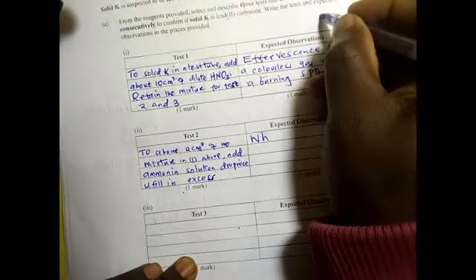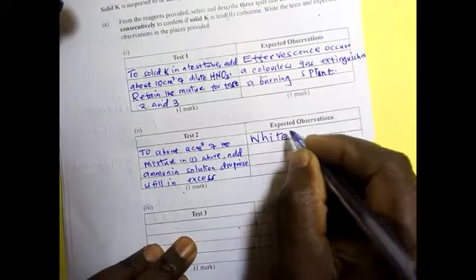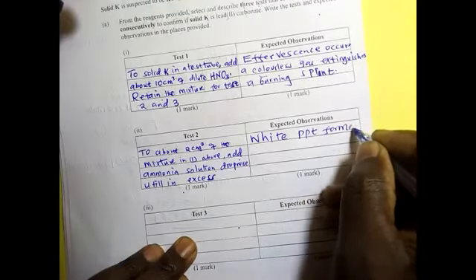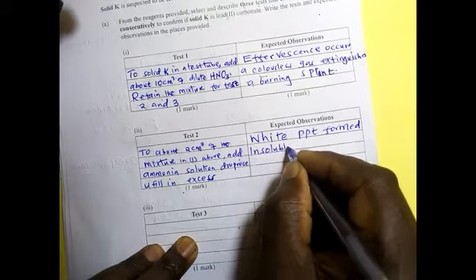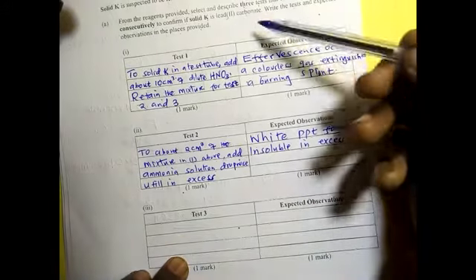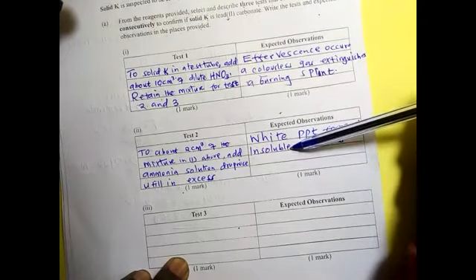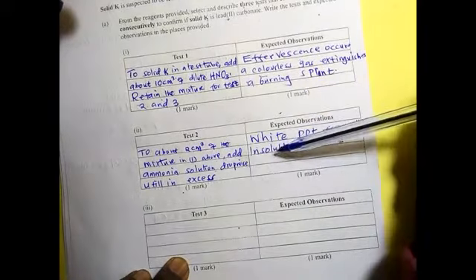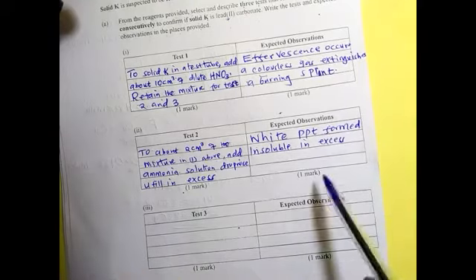Lead is among the amphoteric. A white precipitate is formed, insoluble in excess. If it was zinc, it would form a colorless solution in excess.